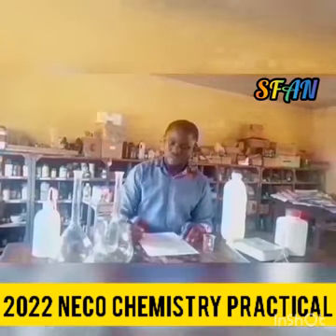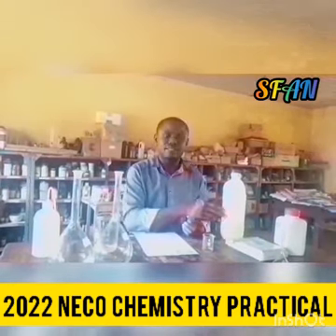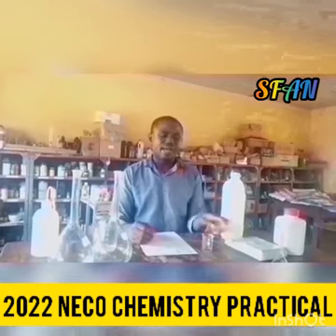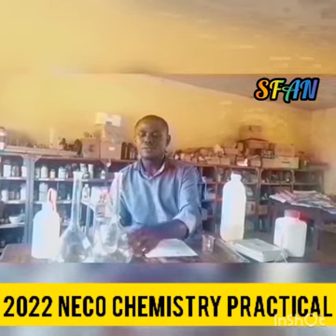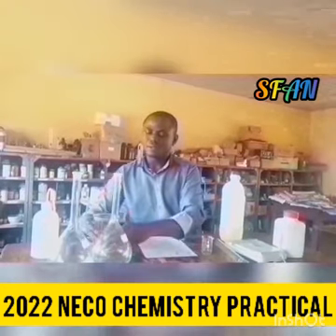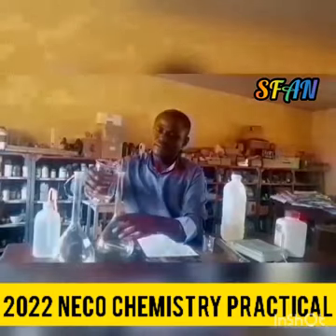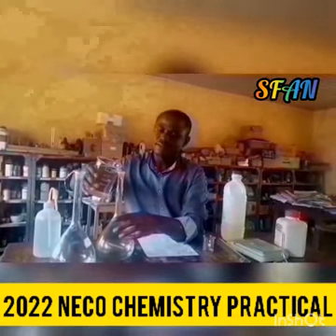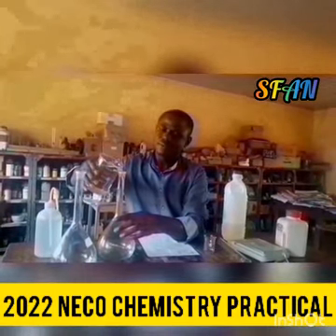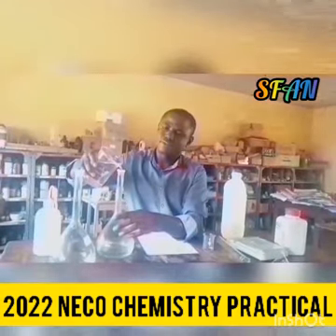So from our instruction, we are going to measure 9.5 cm³ of this nitric acid, and then we are going to transfer it to our volumetric flask. But before that, we are going to transfer 500 cm³ of distilled water to our volumetric flask.